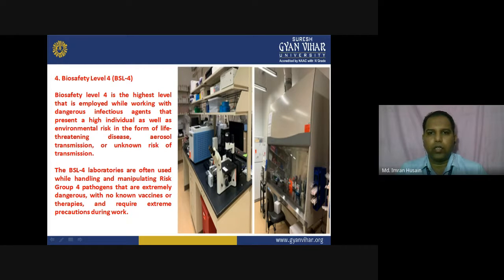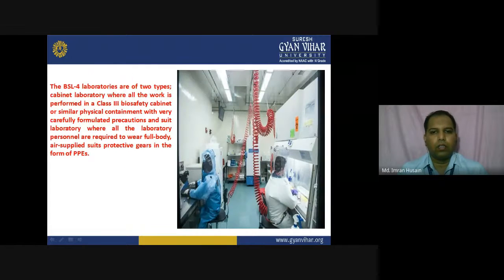Nothing was known, and still the scientists were working 24/7 effectively, and they developed a vaccine. So here in this image, you can see the scientists wearing biosuits along with the PPE kit inside it, and these cables are connected for providing them their individual atmosphere.